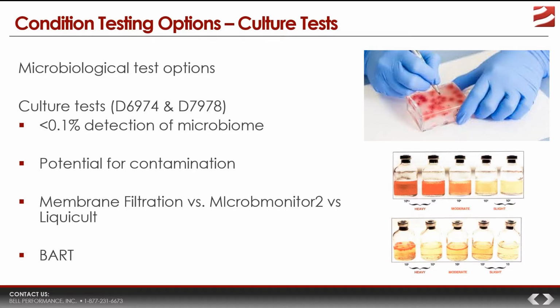Some of them select for acid-forming and slime-forming, and there's a bunch of different kinds of bottles. So in the end, depending on the results that you get, you can get a more specific picture of the kinds or the classes of microbes that are in your sample, which does give you a little bit more useful information.